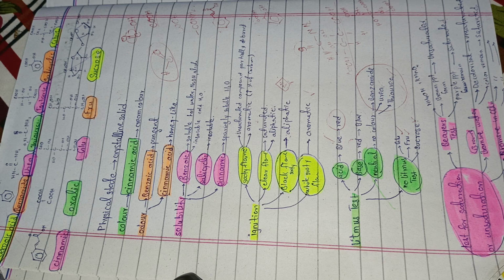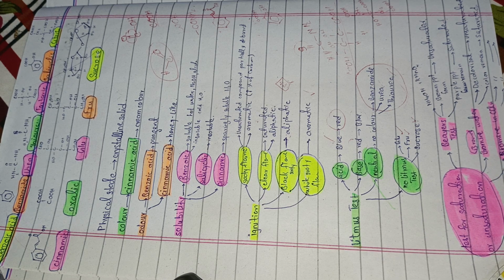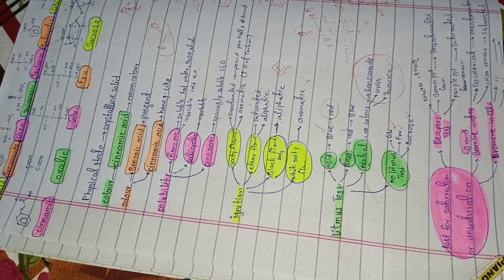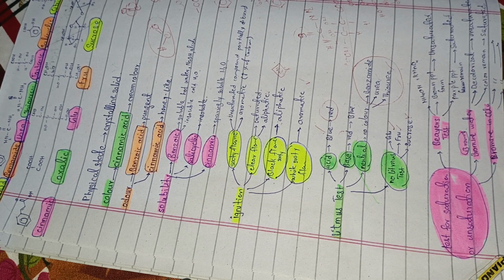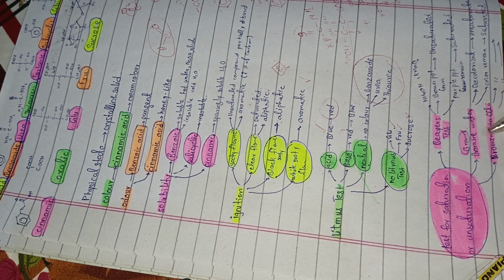So now we are going to discuss the test for saturated and the test for unsaturated compounds. We want to know whether our compound is saturated or not. In order to know whether your compound is saturated or unsaturated, you have to perform some tests. So we have three tests here.